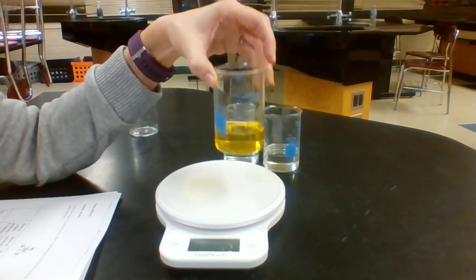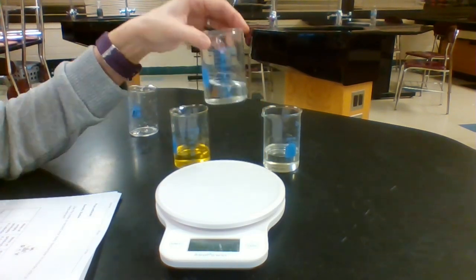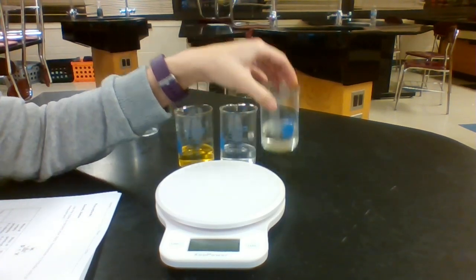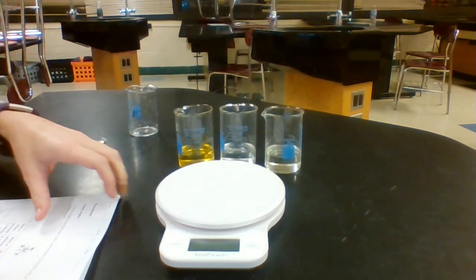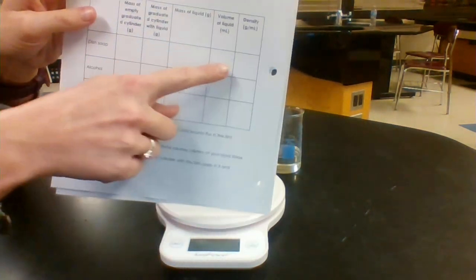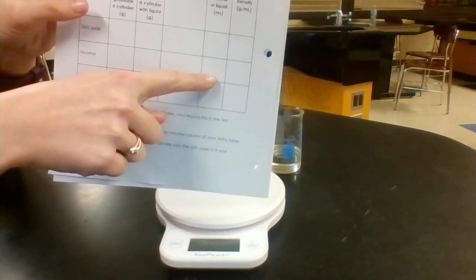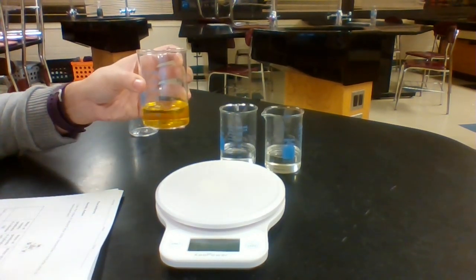So I have 50 milliliters of dish soap. I have 50 milliliters of rubbing alcohol. And I have 50 milliliters of corn syrup. Make sure that you're writing all of that down in your data table, that it's 50 milliliters, 50 milliliters, 50 milliliters. What we're going to do now is find the mass of the liquid.